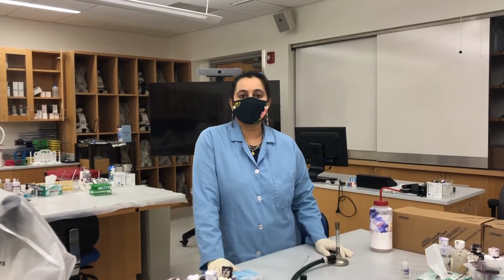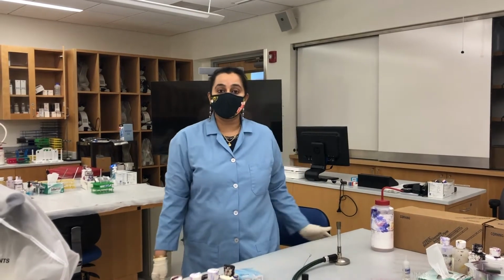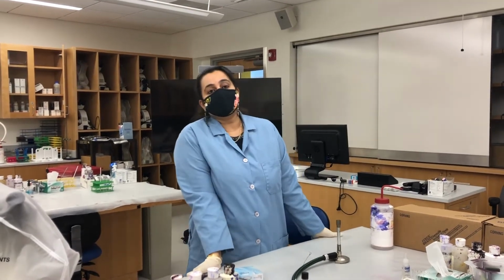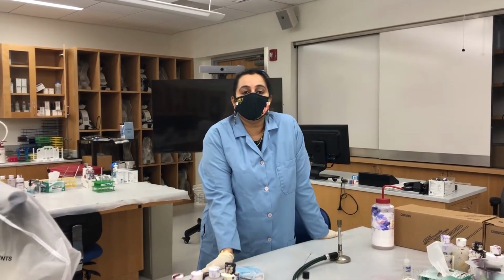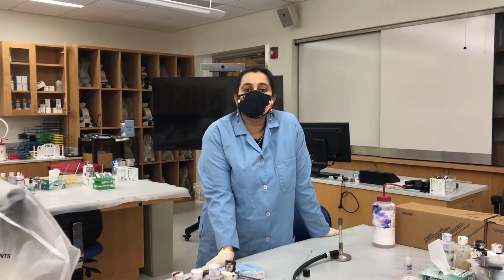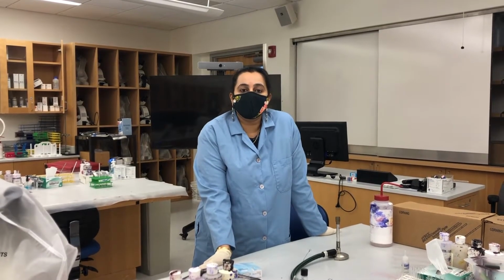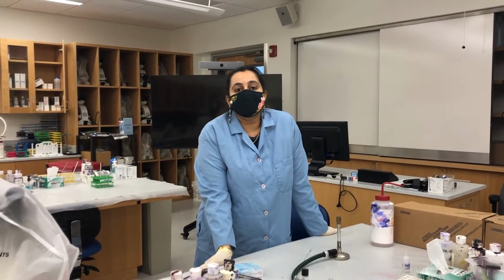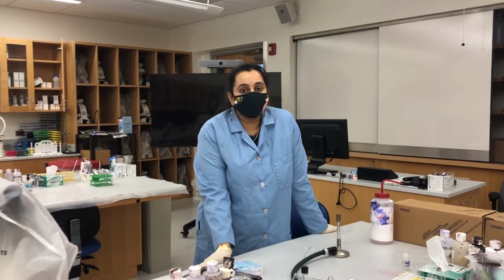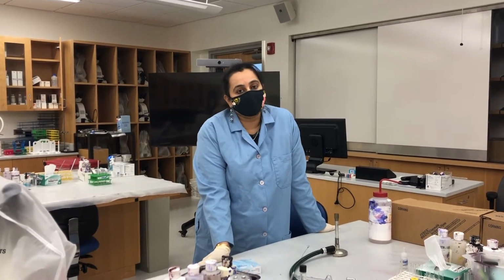As I always said, there are multiple staining techniques in microbiology diagnostic labs. The very first technique that anybody can use is a simple staining technique. Simple staining is you just use one basic stain to quickly take a look at the shape and size of the cells. But that will not give you much of an information. So that is the reason we need to go for differential staining technique.